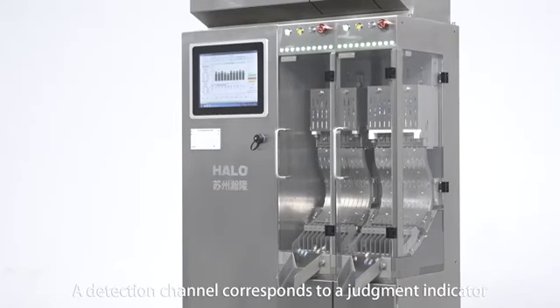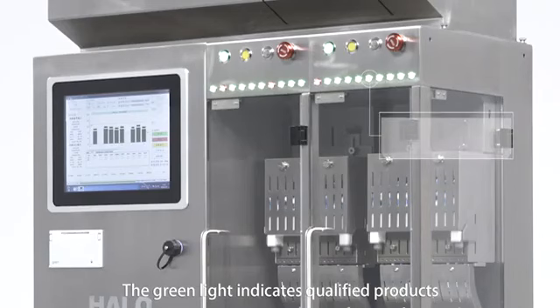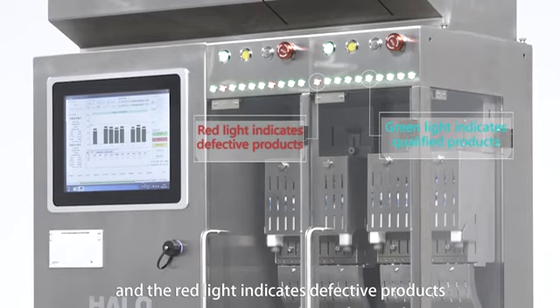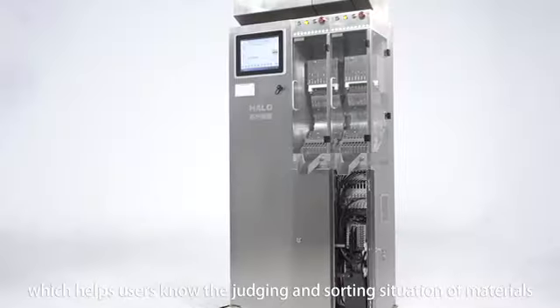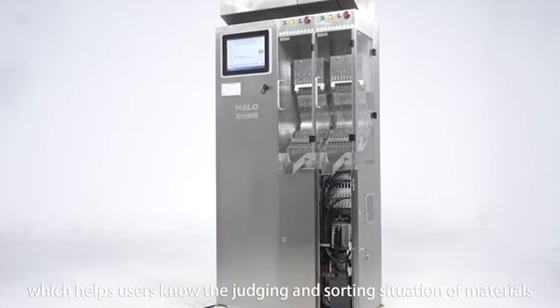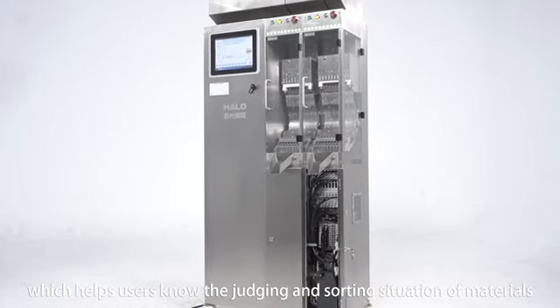A detection channel corresponds to a judgment indicator. The green light indicates qualified products and the red light indicates defective products, which helps users know the judging and sorting situation of materials.